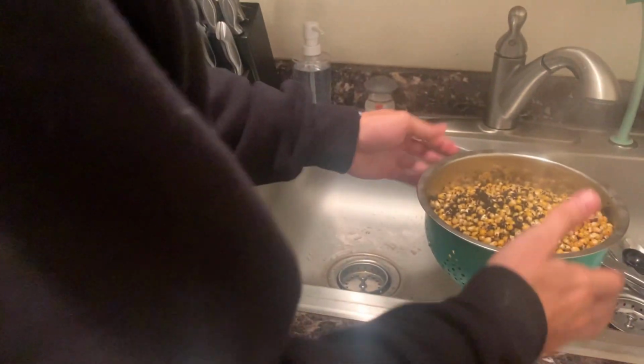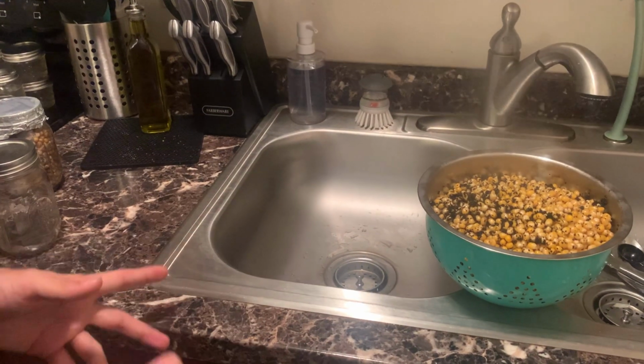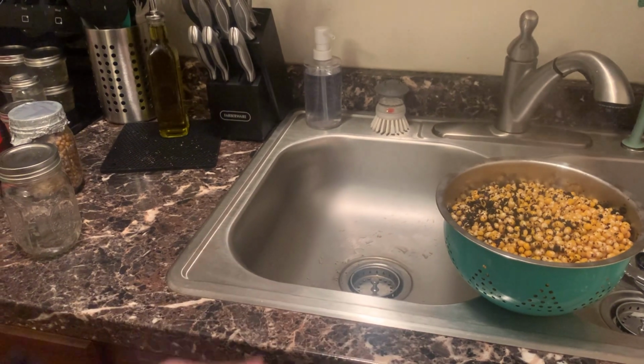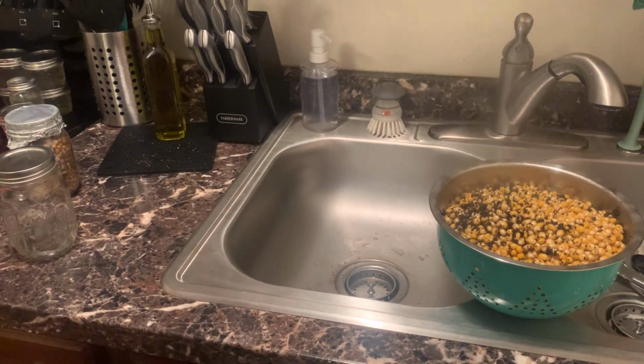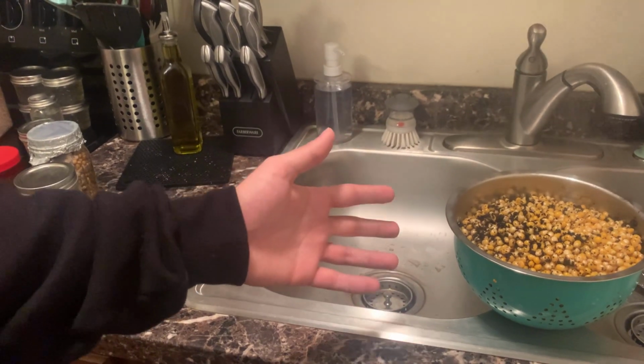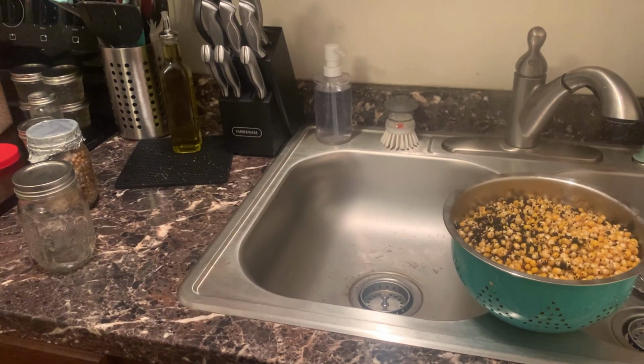And then you're gonna wanna leave it straining to make sure you get all the water out. So you're gonna let that sit for between about 30 minutes, an hour, make sure all the water is out of there. Otherwise, you're gonna have water in your jars. You could possibly get wet rot. It's just a breeding ground for contamination. So you wanna let this strain. So I'll come back in about 20, 30 minutes and we'll finish the rest.